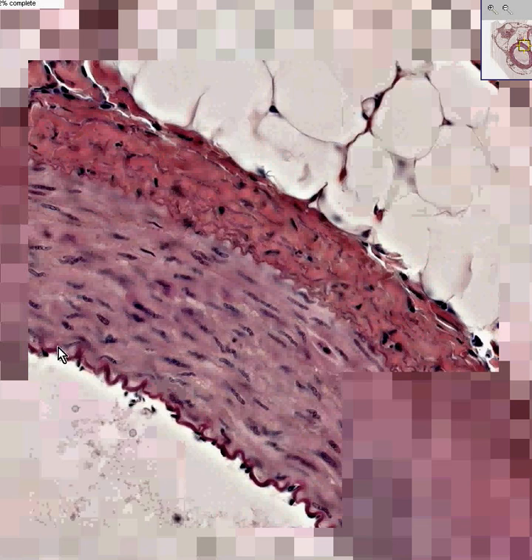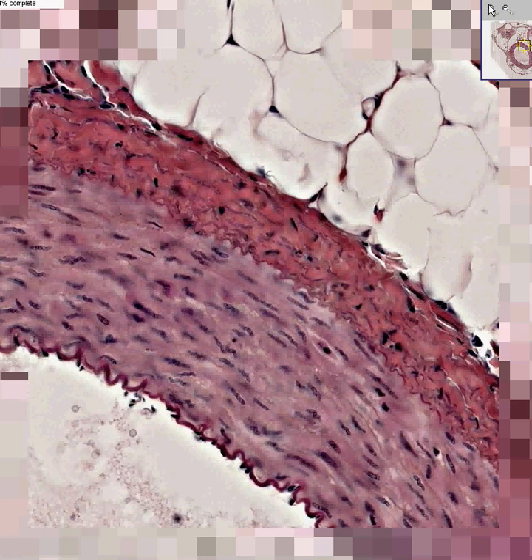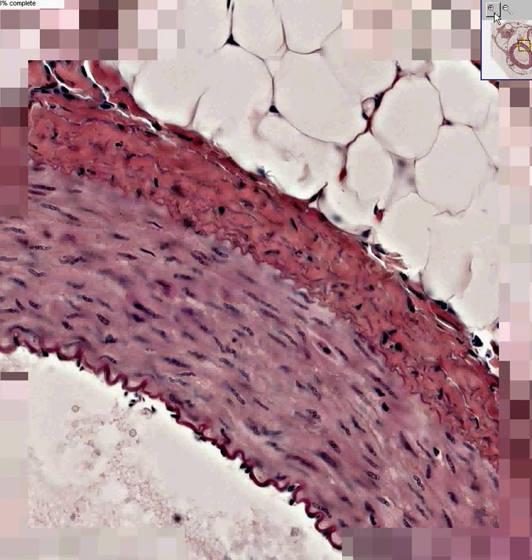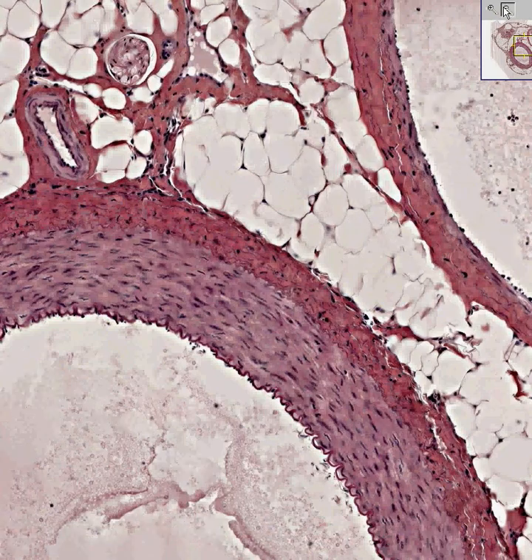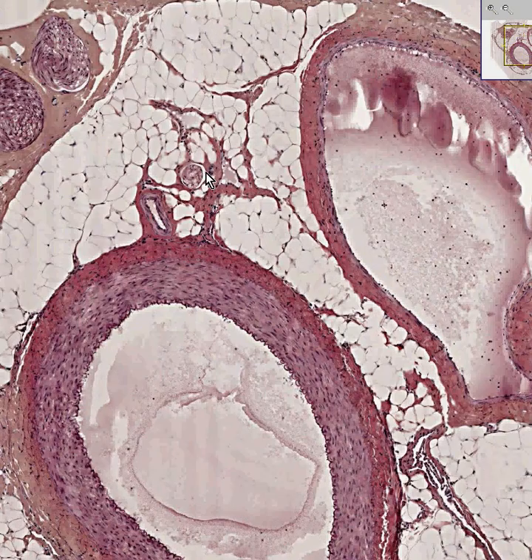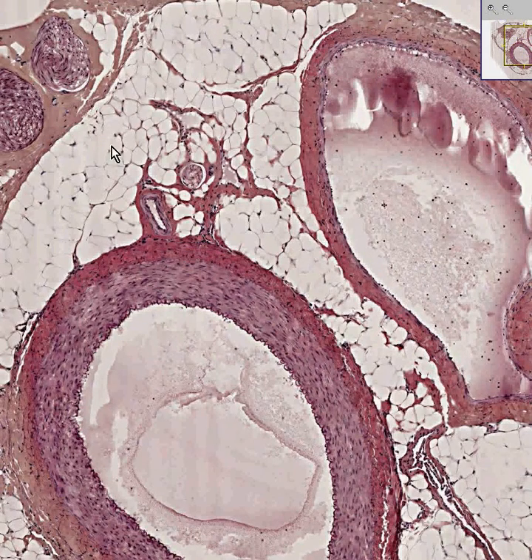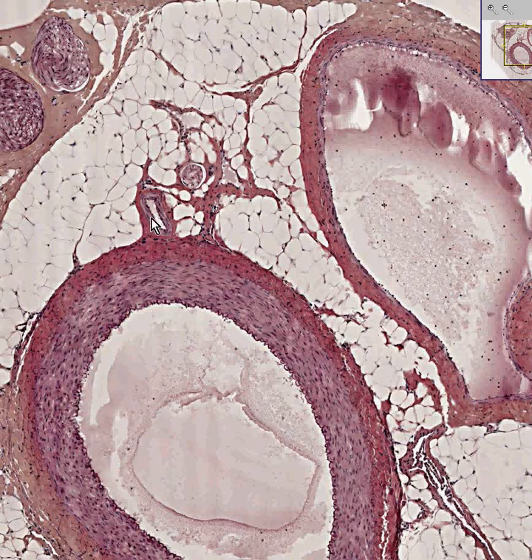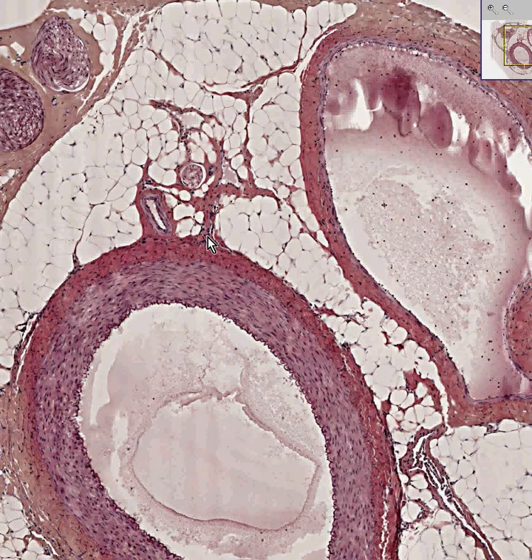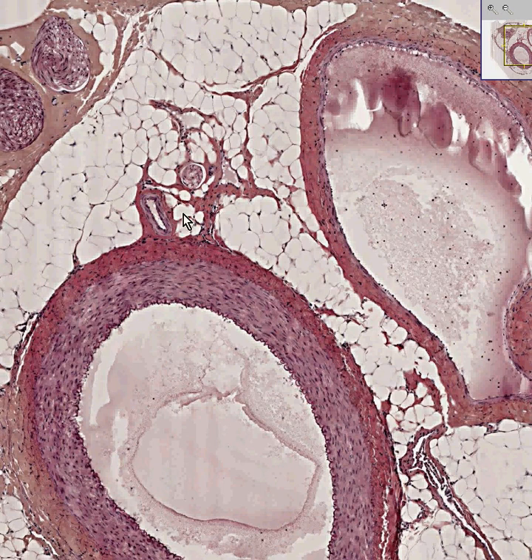And in between everything is your loose fibrous connective tissue, chiefly adipose tissue. There are some vessels of the adventitia known as the vasa vasorum. And once again, this is called shotgun histology, so I suspect there's not a single thing on here you can't identify. And I thank you very much.